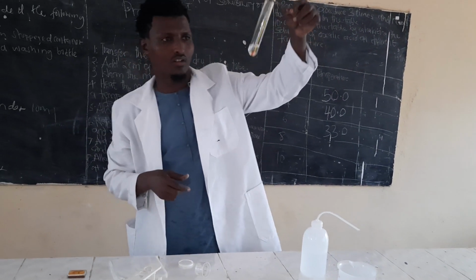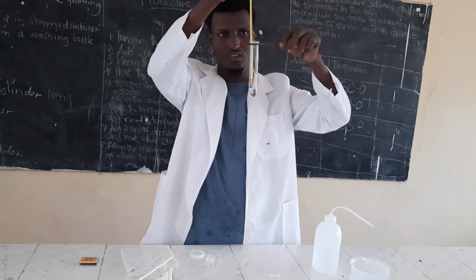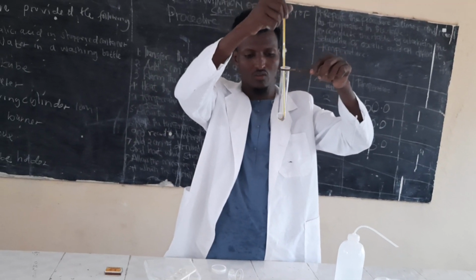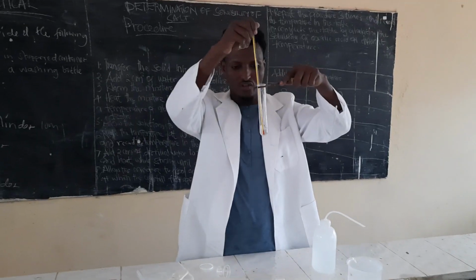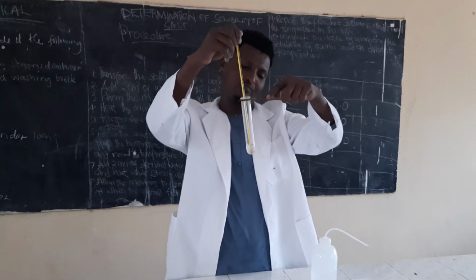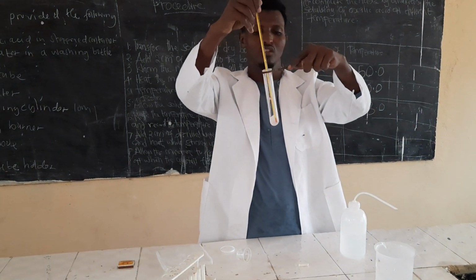Just wait, so that crystals are going to form. Crystals are going to form. See now, the solid started to form. That is why you should not hurry. The solids are going to form.